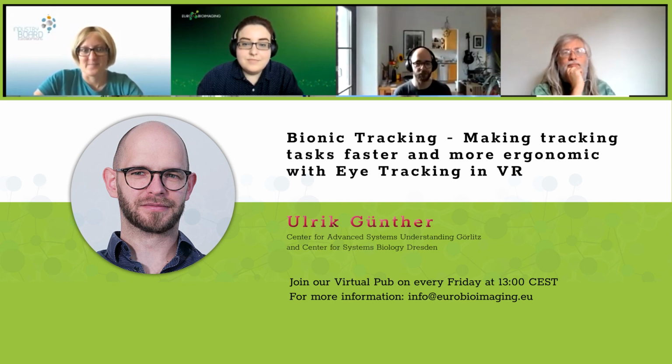We actually haven't done multi-channel stuff yet, but my assumption here would be that you would probably want to do this by channel. If you've labeled wildly different things, let's say a membrane marker and a nuclear marker, you would look in entirely different places, so it would make sense to show them separately. But if you just want to do cell tracking, if you just want to know where did this go, then you would probably just focus on one channel and follow this one around.